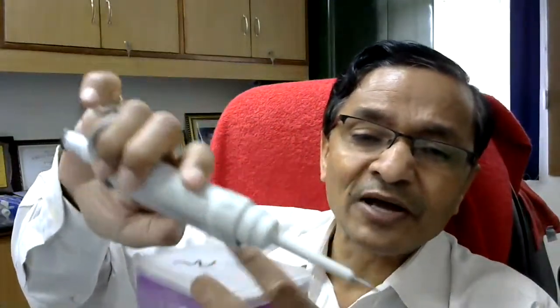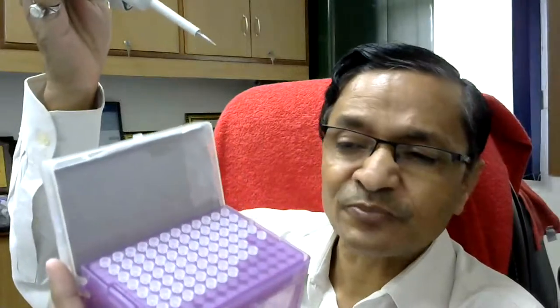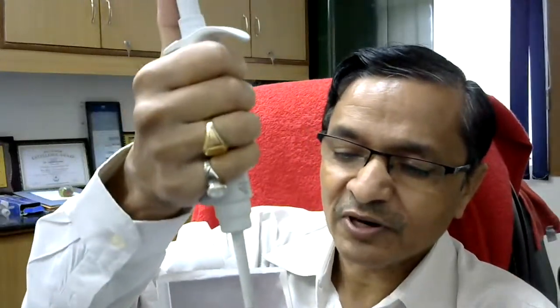Similarly, if we are going to use a pipette like 0.5 microliter, 2.5 microliter, 2 microliter, or maybe 1 microliter, then micro tips should be used. You can see these are the micro tips. These are again filled with tips and autoclaved. So you have to put your tips, and now you see.